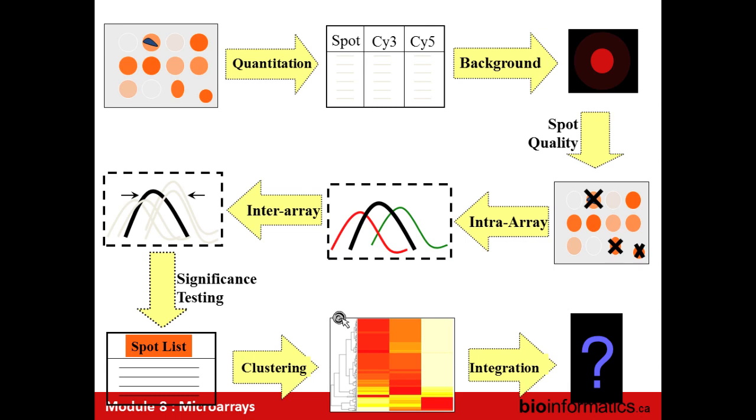That are in any sort of regular use anywhere. There's a couple of basic things, like you have negative control probes and positive control probes, and you verify that the negatives are negative, the positives are positive, but in a kind of systematic QA/QC, no, I'm not aware of anything.